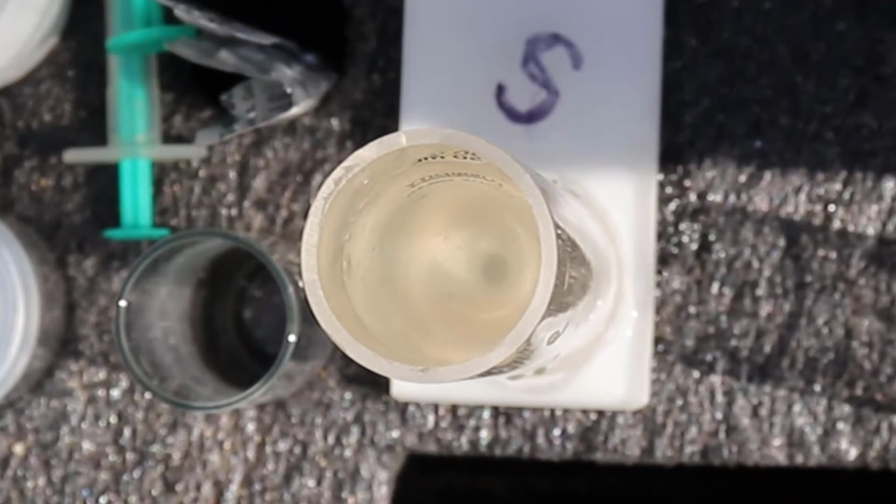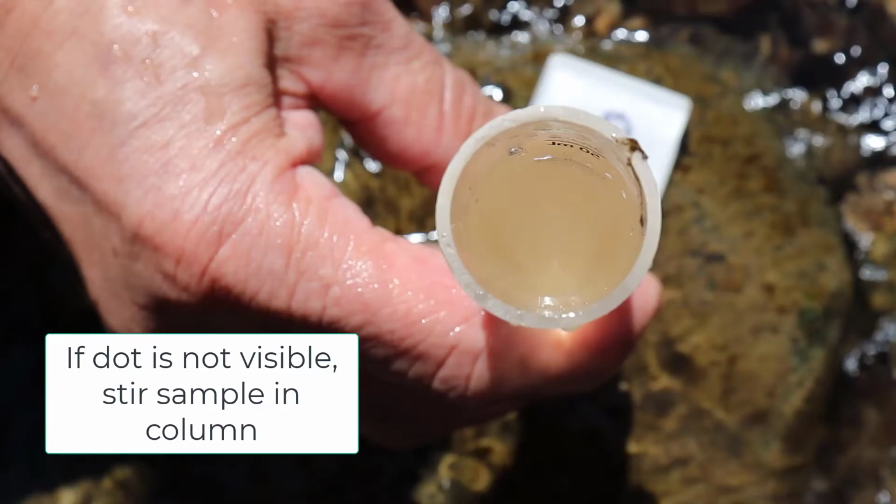Position yourself so that you can look down into the column through the opening, preferably from a distance of only about 6 inches. You should see a black dot on the bottom of the column. If the black dot on the bottom of the column is not visible when looking down through the column, find the clear stirring rod and stir the water sample in the column.